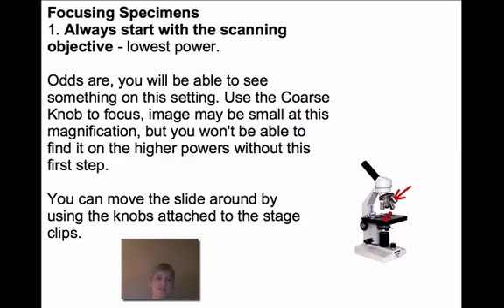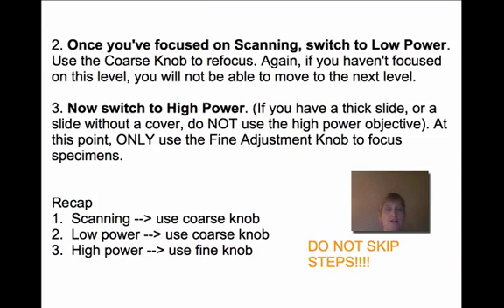Now, you might have to move the slide around, but you're going to use the knobs that are attached to the stage clips. So those knobs will move your slide back and forth, or they'll move it front to back. So always make sure you're using those knobs and not just trying to slide the glass slide around on the stage.